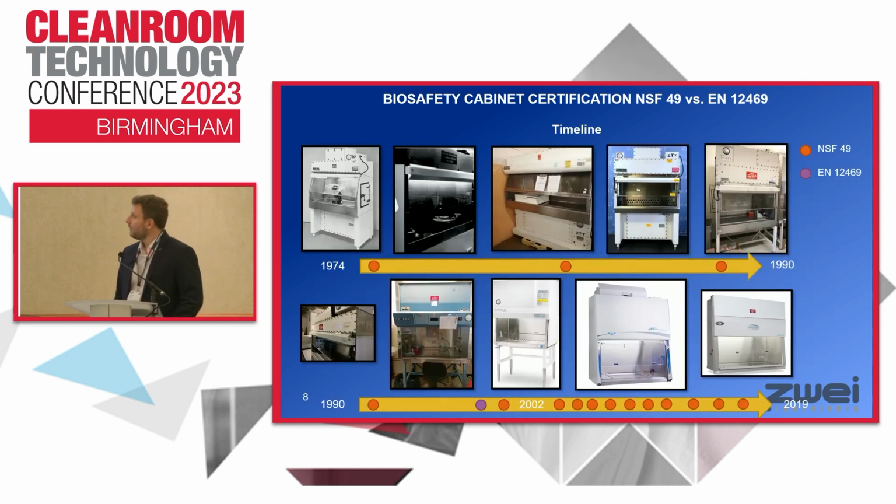This timeline illustrates the changes in biosafety cabinet design concept and the technology from the 70s to the present. We have the different updates of NSF 49, the EN, and another update of NSF.